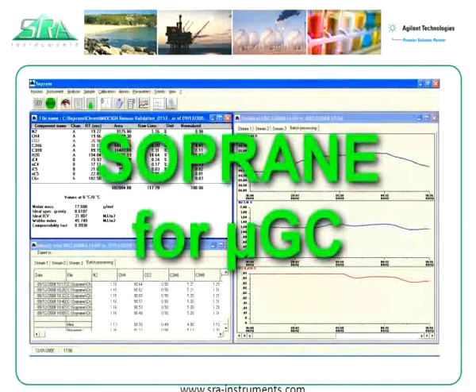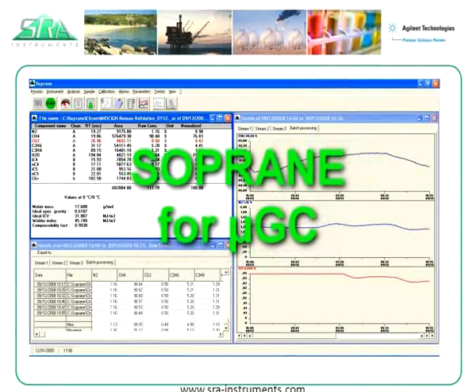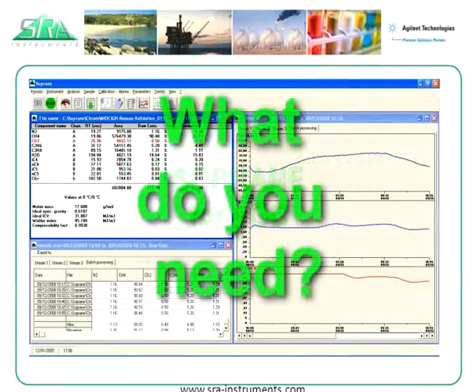In this presentation we would like to show some of the ways that Sopran can make the MicroGC a simple and efficient tool for your gas analysis needs.